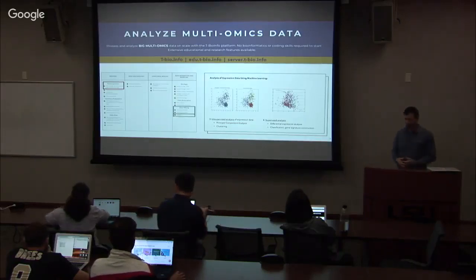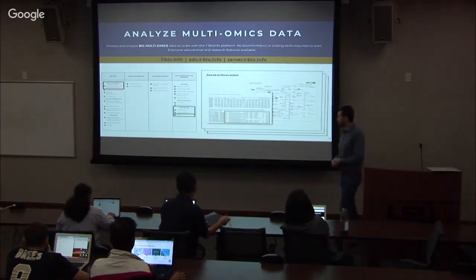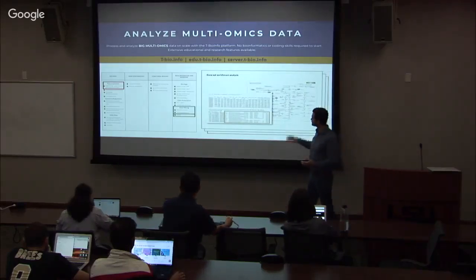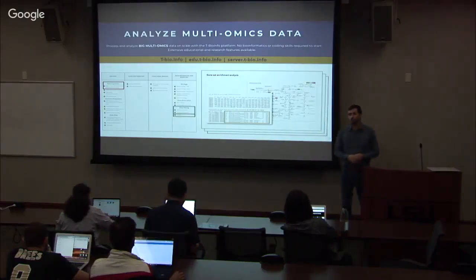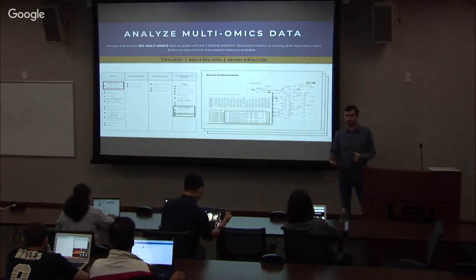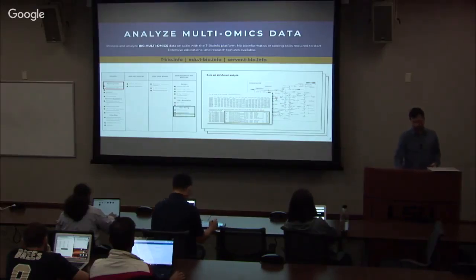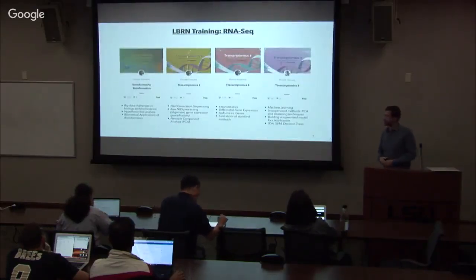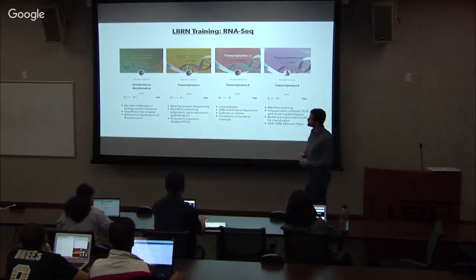Then we'll talk about utilities, where we have a couple of methods for interpretation. I don't know if the quality of this is good enough, but we'll see how we convert the gene IDs that we get in the gene expression table to something meaningful that we can look at from a biological perspective.